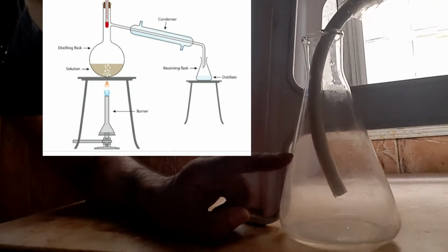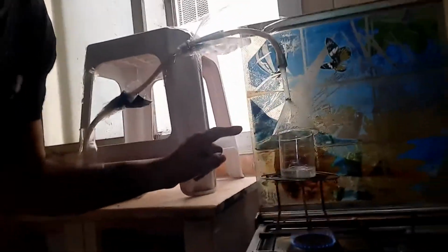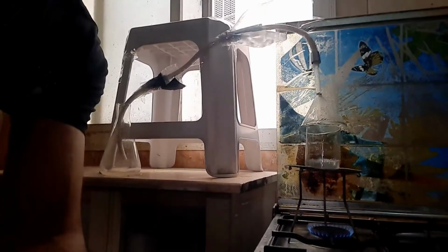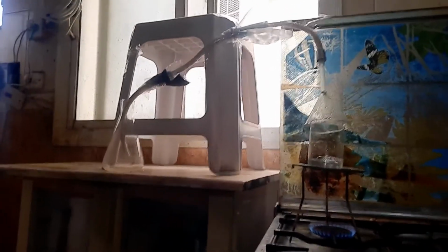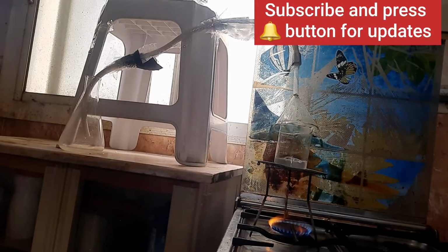At the end we will get all of the water here, and in the beaker we will have remaining something like salt. So we need to wait a little bit such that the procedure is completed. Then at the end we will have a result. You can see that the water is boiling and the bubbles indicate boiling.